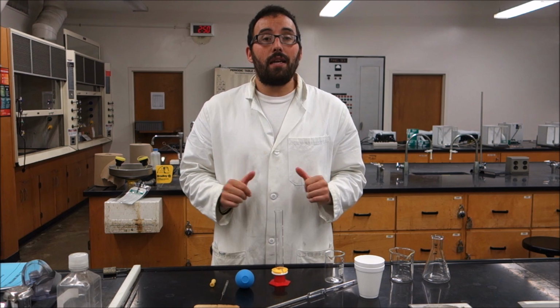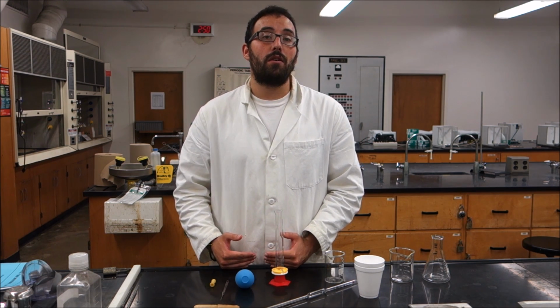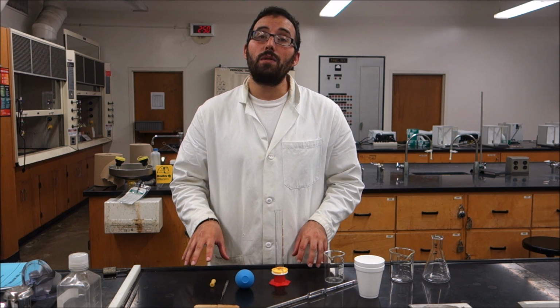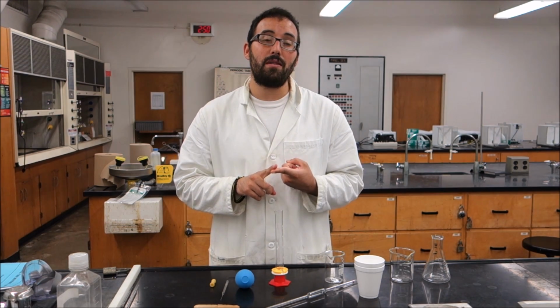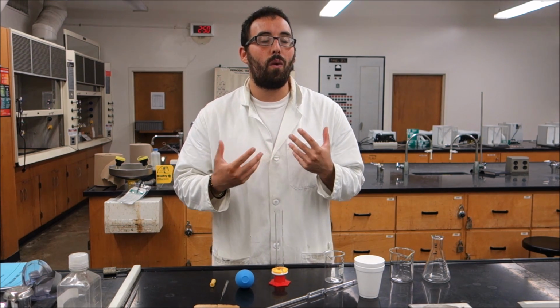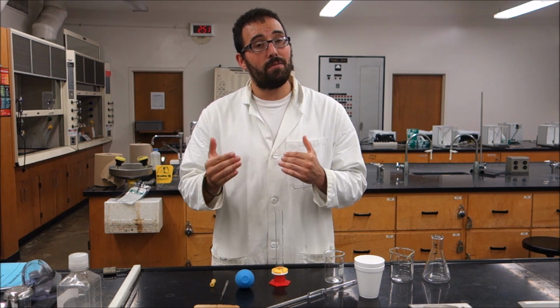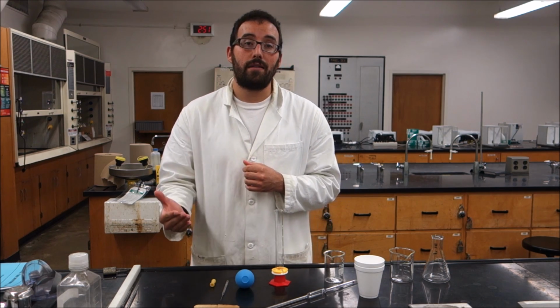Now, when you're setting up your experiment, there are a few things you're really going to have to think about, namely errors that you can introduce into your experiment. Think about what types of things can happen when you have hot water, what the hot water is going to be doing while it's hot, how that might affect taking measurements, as well as how that might affect your final answer.